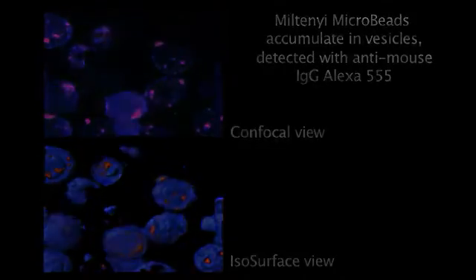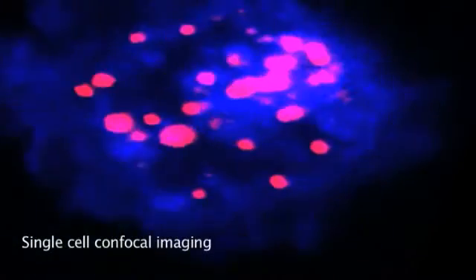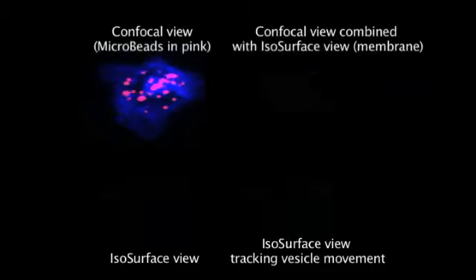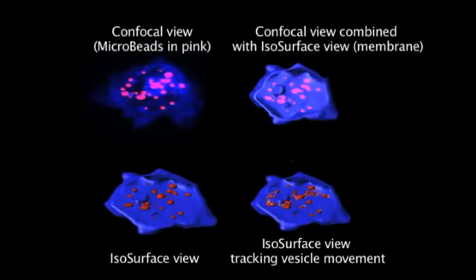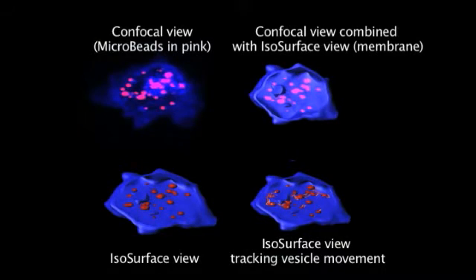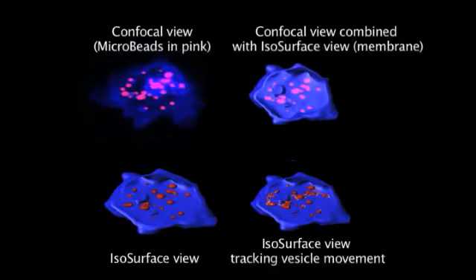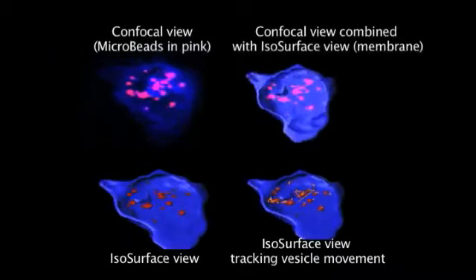Let's focus on a single cell. The top left is the confocal image, while the top right is a mix of confocal image of the beads and isosurface view of the cell membrane. The bottom left is the isosurface view, and the bottom right is the isosurface view tracking vesicle movements.